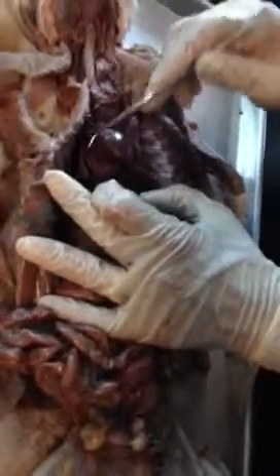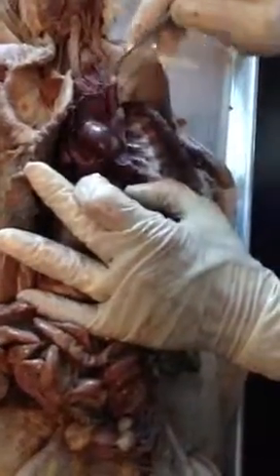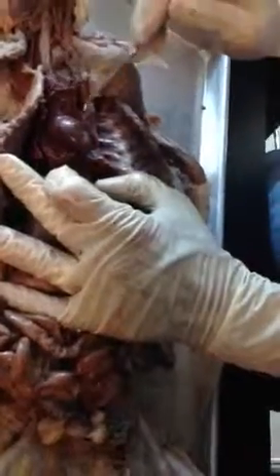The trachea obviously goes into the lungs. 3 lobes on this side, 3 lobes on this side. These are anterior, these are posterior.